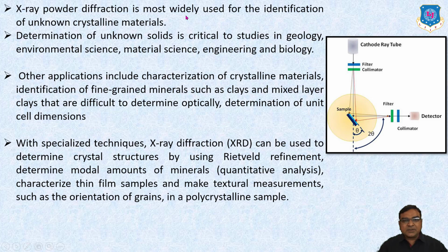X-ray powder diffraction is most widely used for the identification of unknown crystalline materials. Determination of unknown solids is critical to studies in geology, environmental science, material science, engineering, and biology. Other applications include characterization of crystalline materials, identification of fine-grained minerals such as clays and mixed layer clays that are difficult to determine optically, and determination of unit cell dimensions.